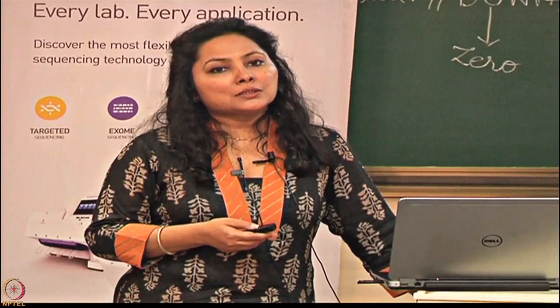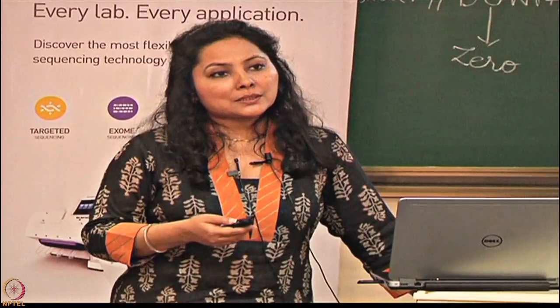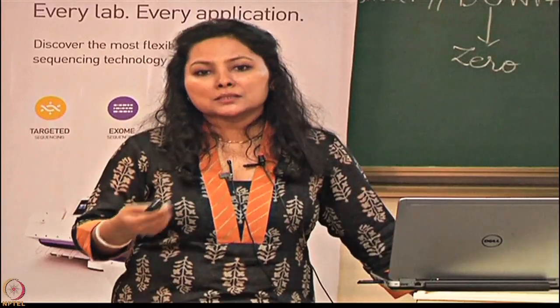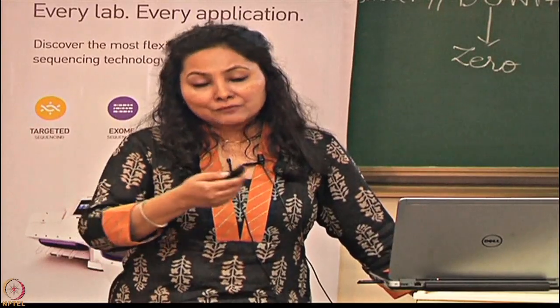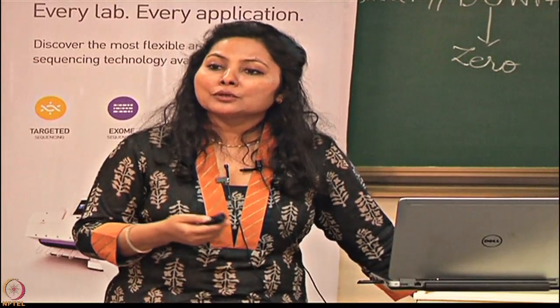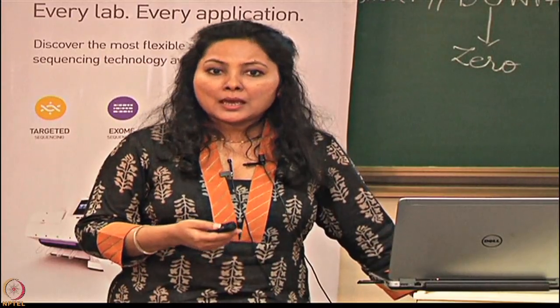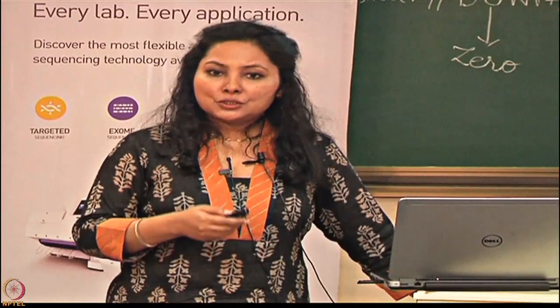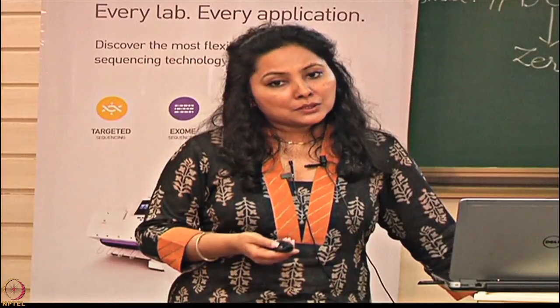With whole genome sequencing, your aim is to sequence that genome as fast as possible, and with as big reads as possible. So probably you will pick up a 400 or a 600 base pair chemistry, and what you need to do with the genome is you shear this genome, you break this genome into smaller pieces. That can be done by enzymatic treatment, or by sonication.